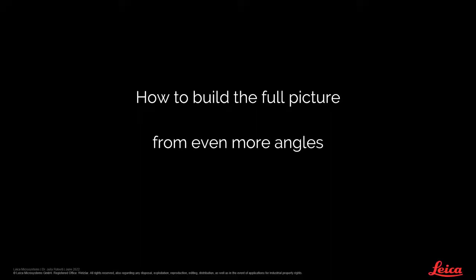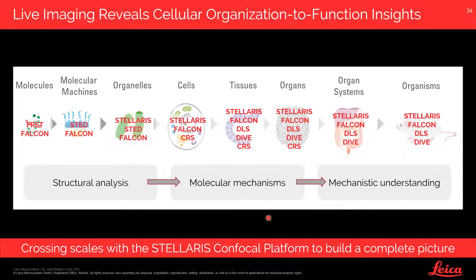Finally, I want to bring a final topic into this presentation and change gears and enter the last part of my talk, in which I want to discuss and show you how to build the full picture from even more angles. And this brings me back to one of the first slides, because we have developed our Confocal with the idea in mind that you can find the answers to your questions with complementary approaches in a single system. So our Confocal is the tool for addressing your science and not a bottleneck.